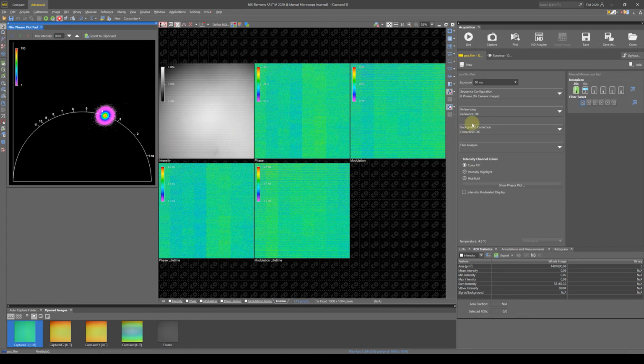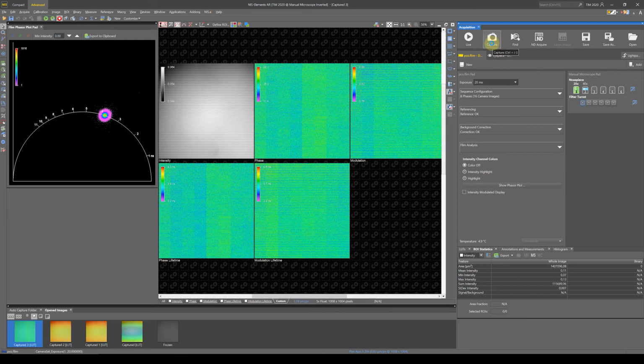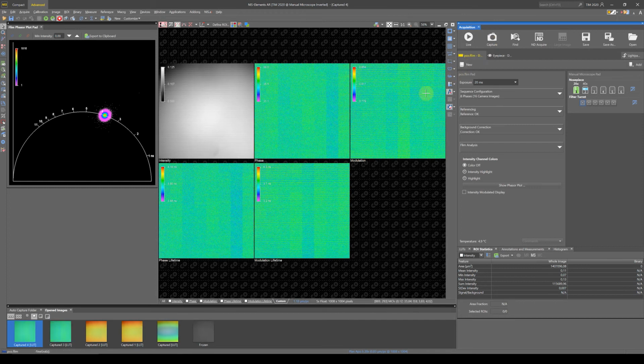Then you might want to have a look at a little larger signal, because then at 20 milliseconds I would expect with the next measurement that the circle of the noise around these 3.7 nanoseconds becomes smaller, which is the result. So this looks like a good reference measurement, and now with this reference measurement you can take as many real data measurements as you like.